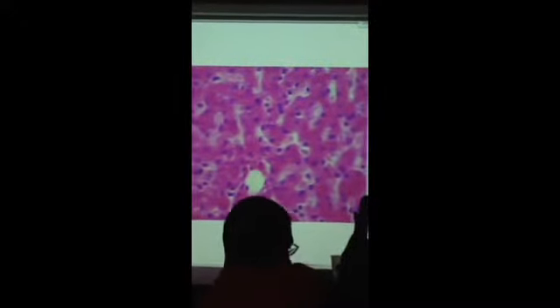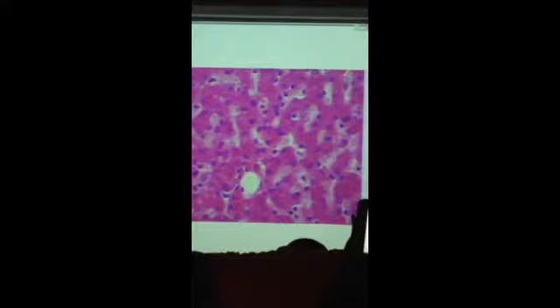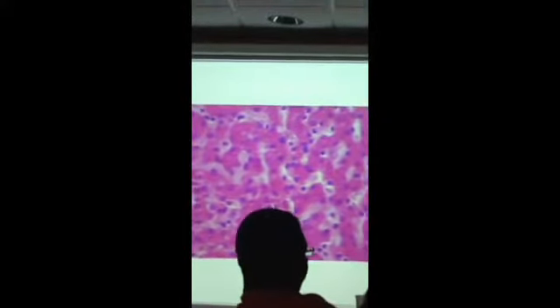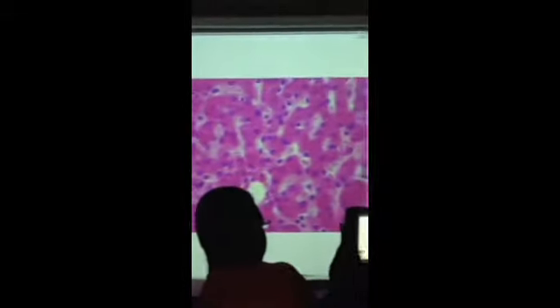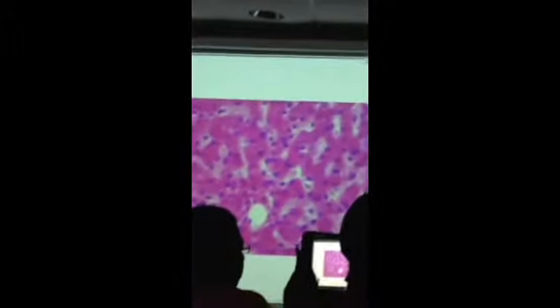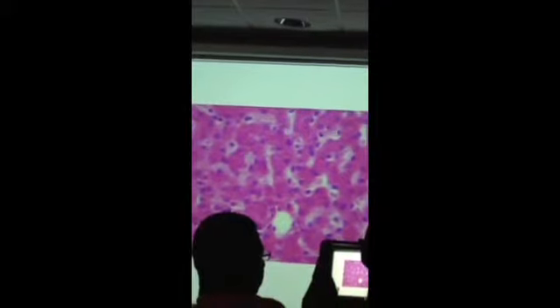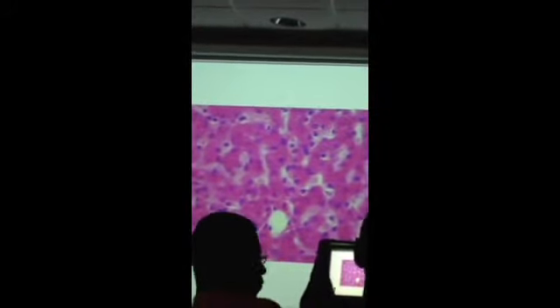Draining blood from the liver capillaries into what major vessel? The inferior vena cava. You see that running through the liver. Okay? Now, where does the blood come from? It feeds these capillaries. What's the source of the blood? It comes from two of the vessels in what we call the portal triad, which are at the edge of the lobules. So let's look at that again.